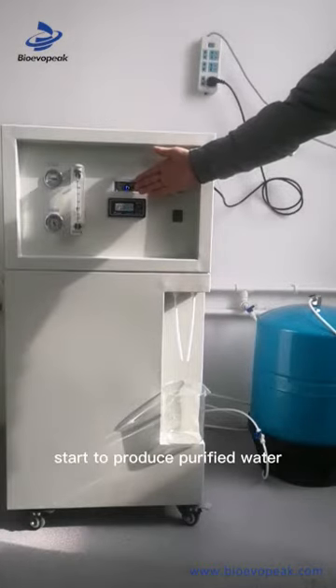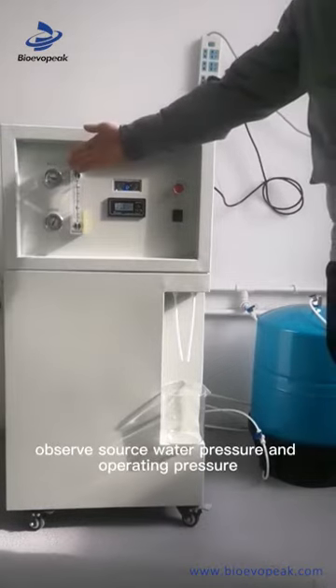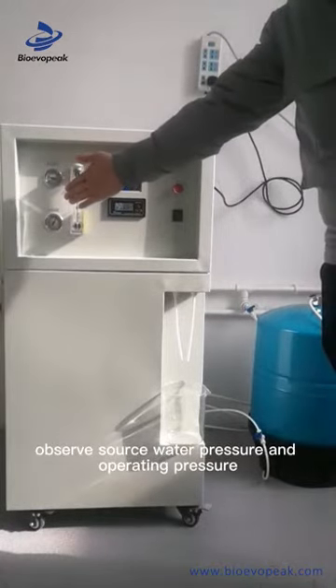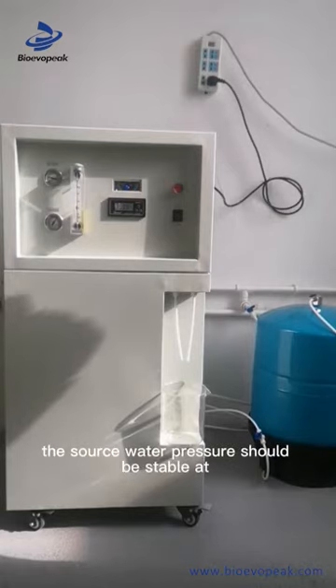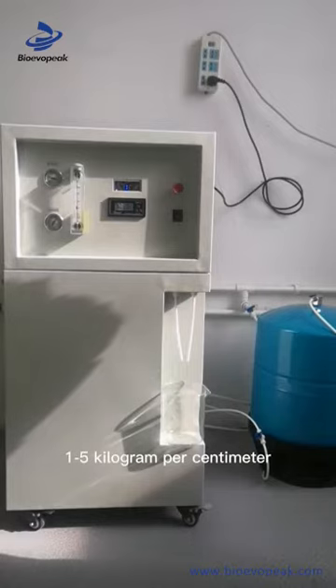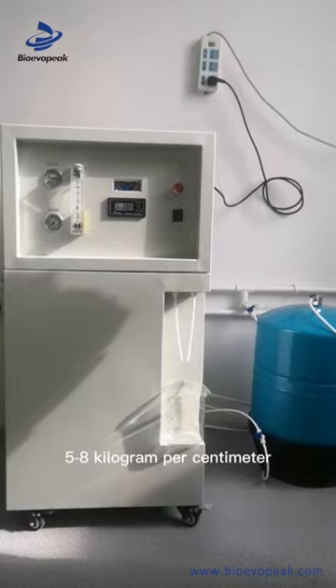Start to produce purified water. Observe the source water pressure and operating pressure. The source water pressure should be stable at 1 to 5 kilogram per centimeter squared. The operating pressure should be stable at 5 to 8 kilogram per centimeter squared.